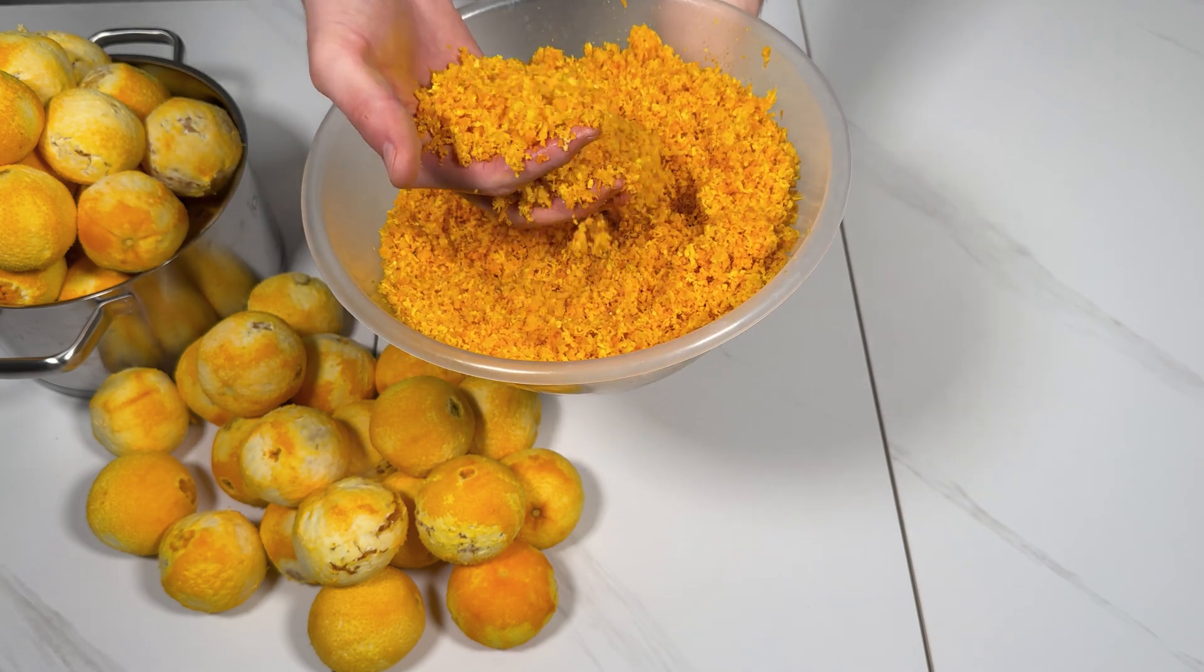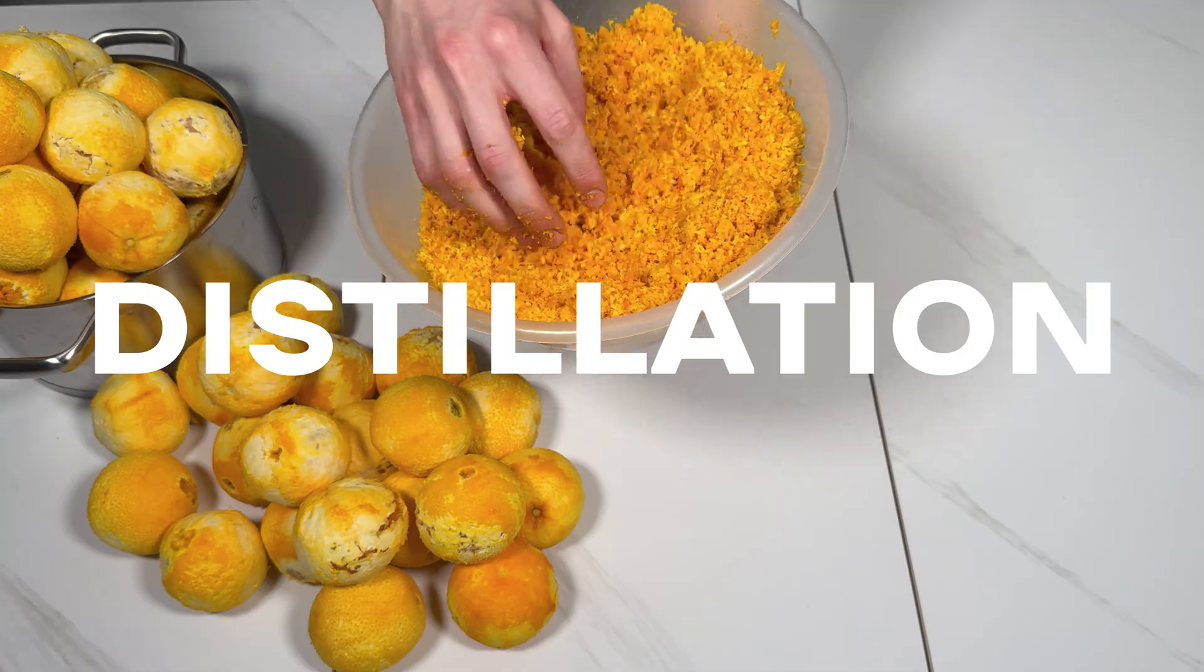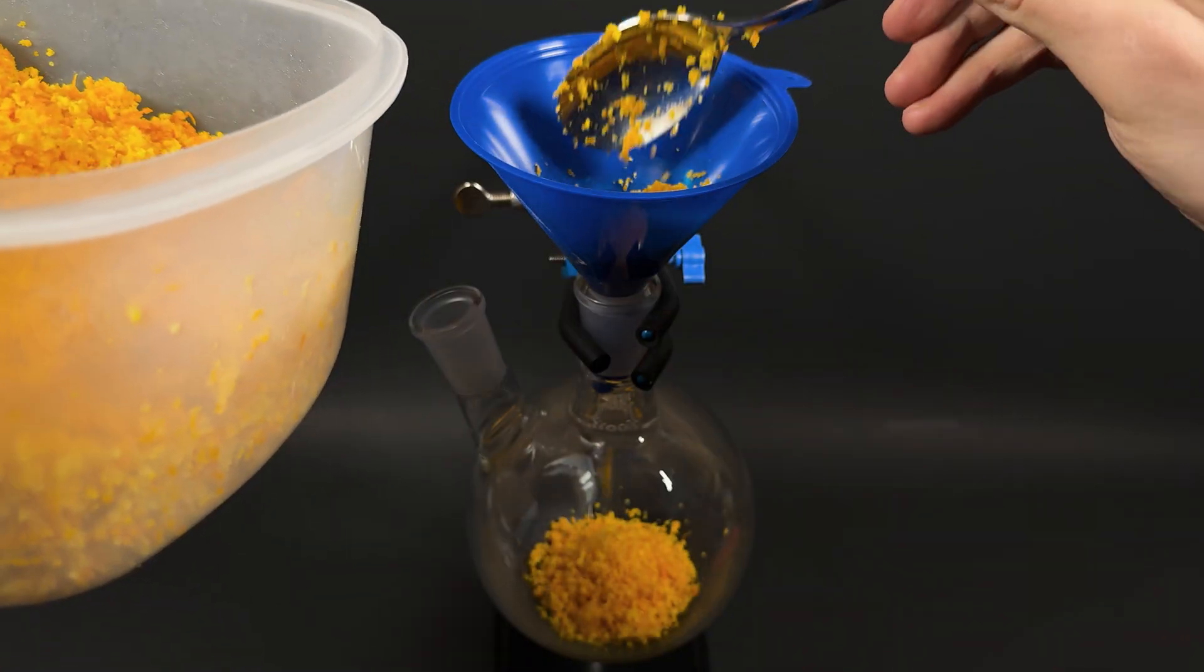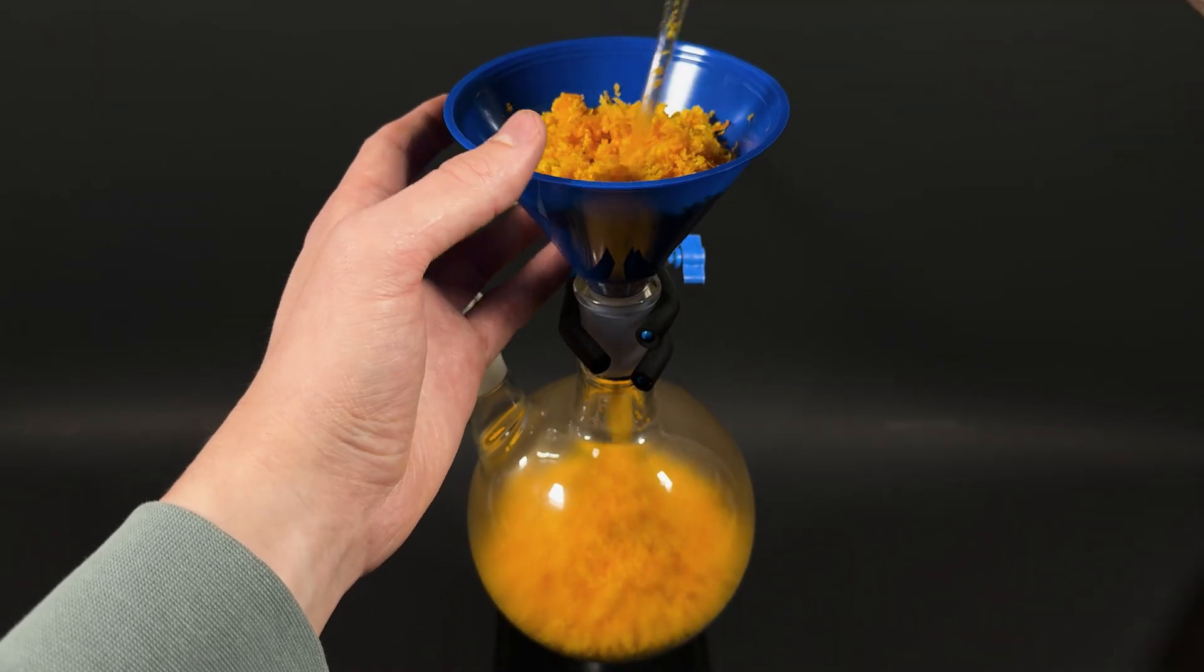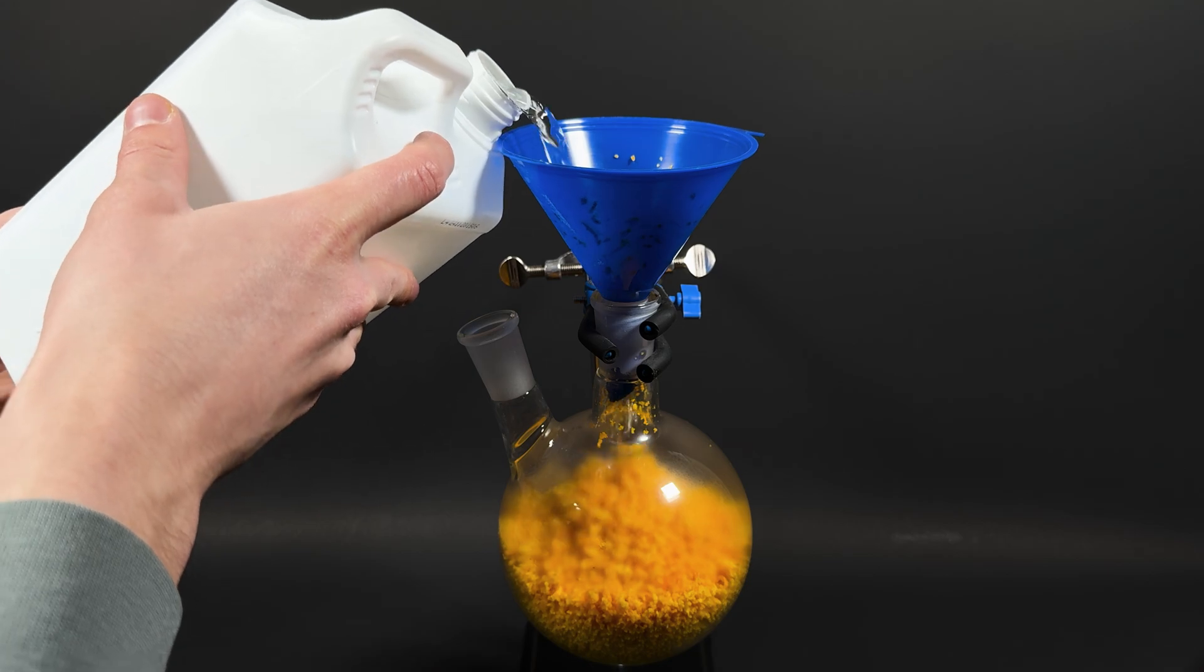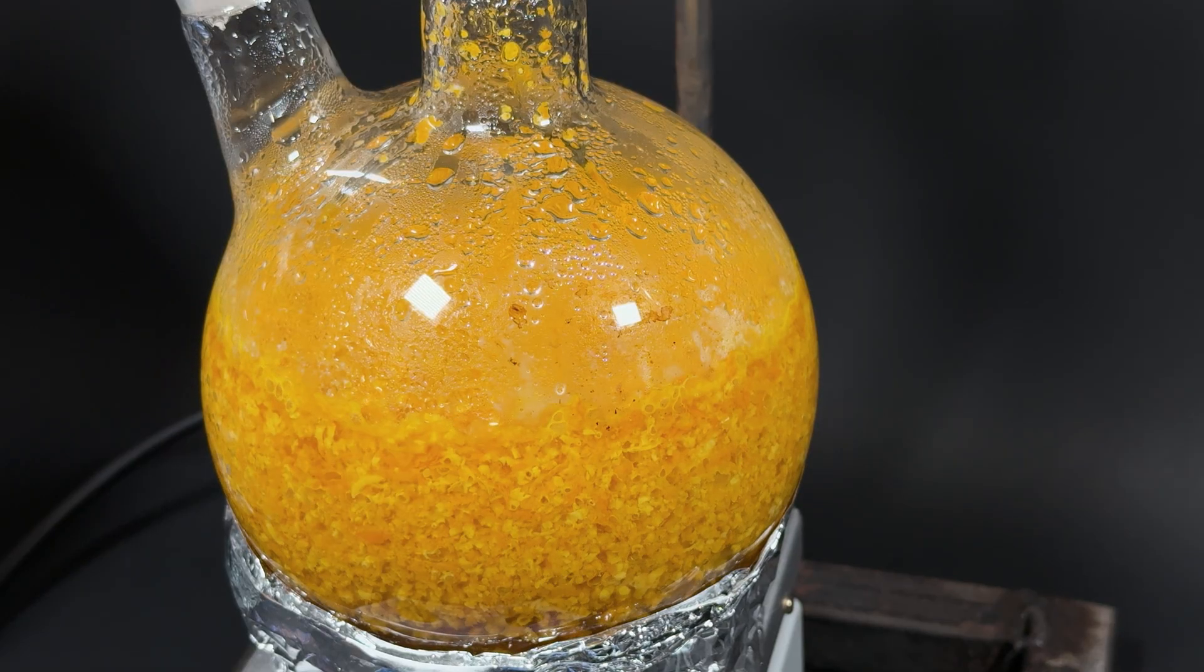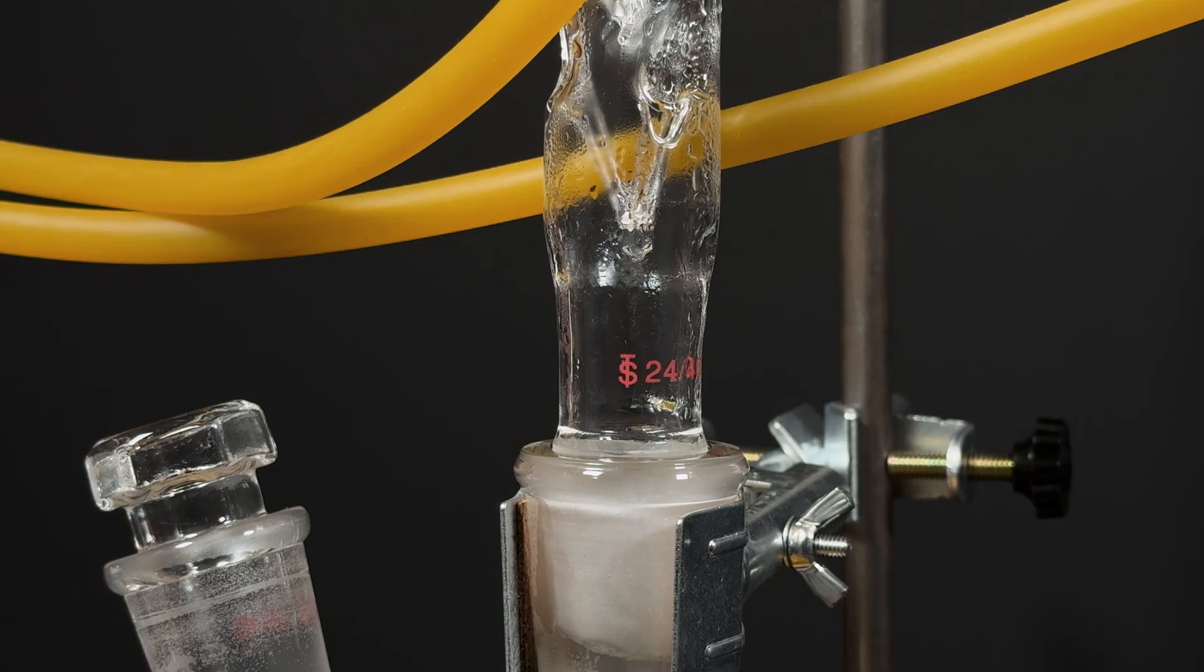Next task, extracting limonene from zest. The easiest way is via distillation. I transfer the zest mash into a 1-liter flask. Unfortunately, that's the biggest I've got, so I split it into two parts. The flask walls quickly fog up. That's the essential oil evaporating. I add water and turn on the heat. Gradually, the mixture boils, and with the steam comes what we need. Cloudy drops appear on the condenser walls. A mixture of water and limonene.